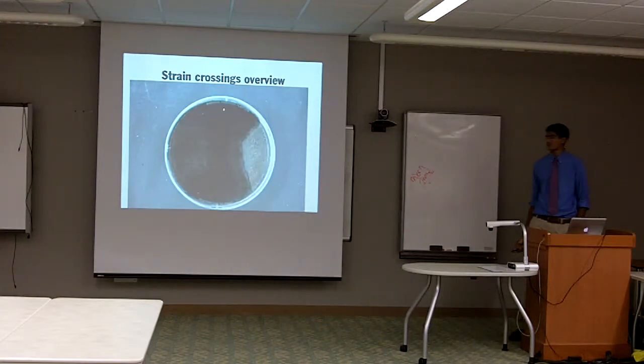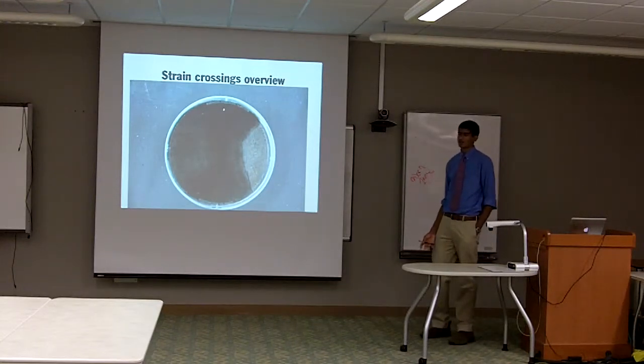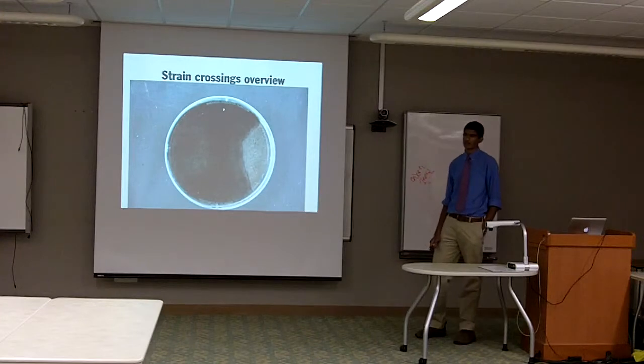Here's that same dish with the lid on. And this lid has the accumulated spores that have been discharged over the last like 2 weeks or so. So notice how the left side of the lid is completely black and just completely covered with all the spores from the wild type.